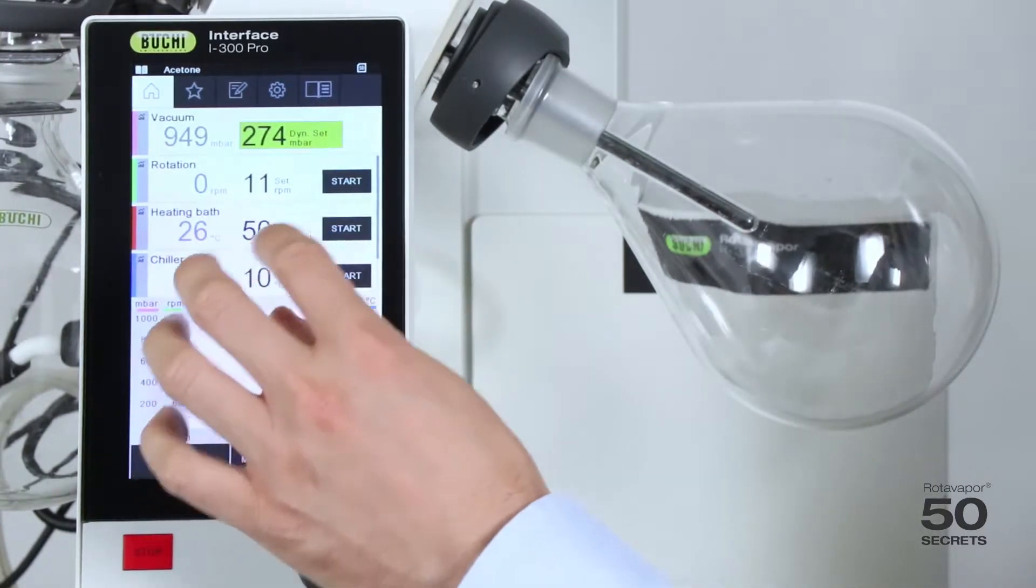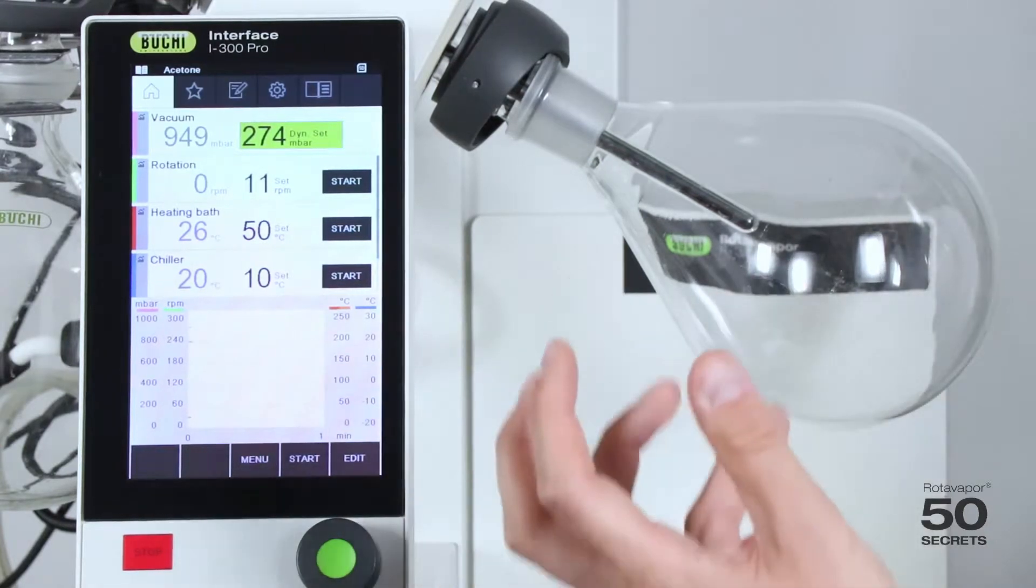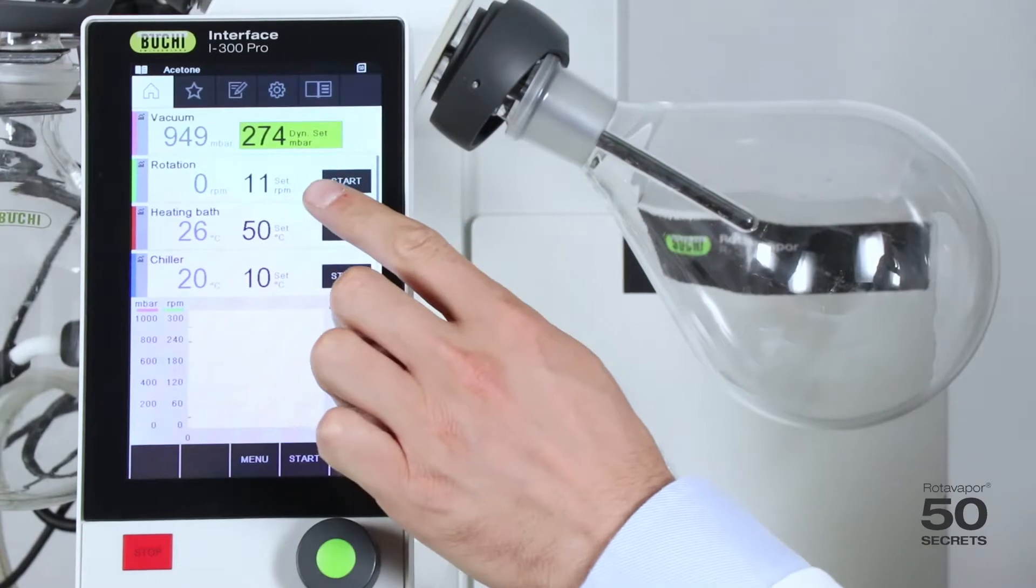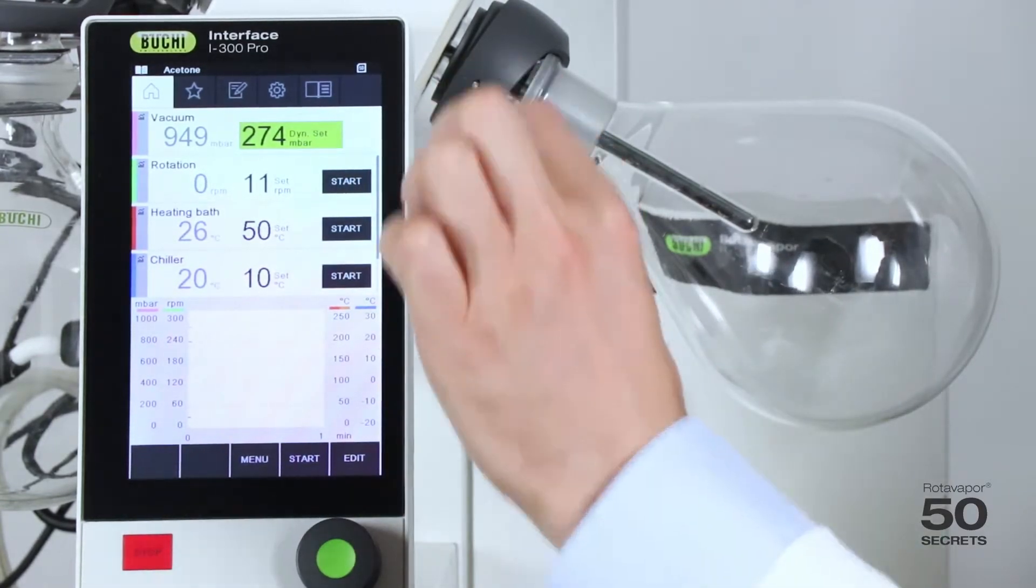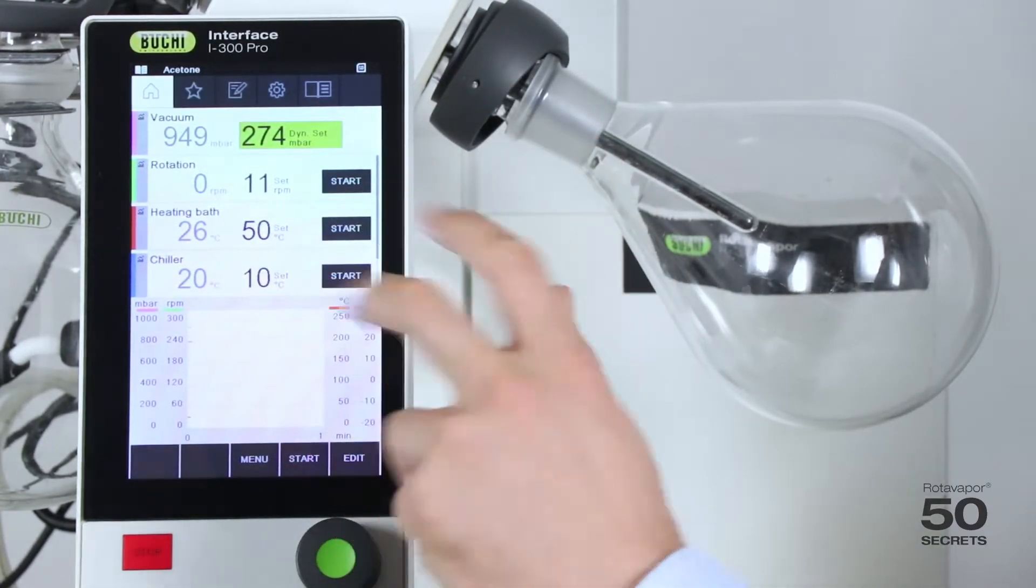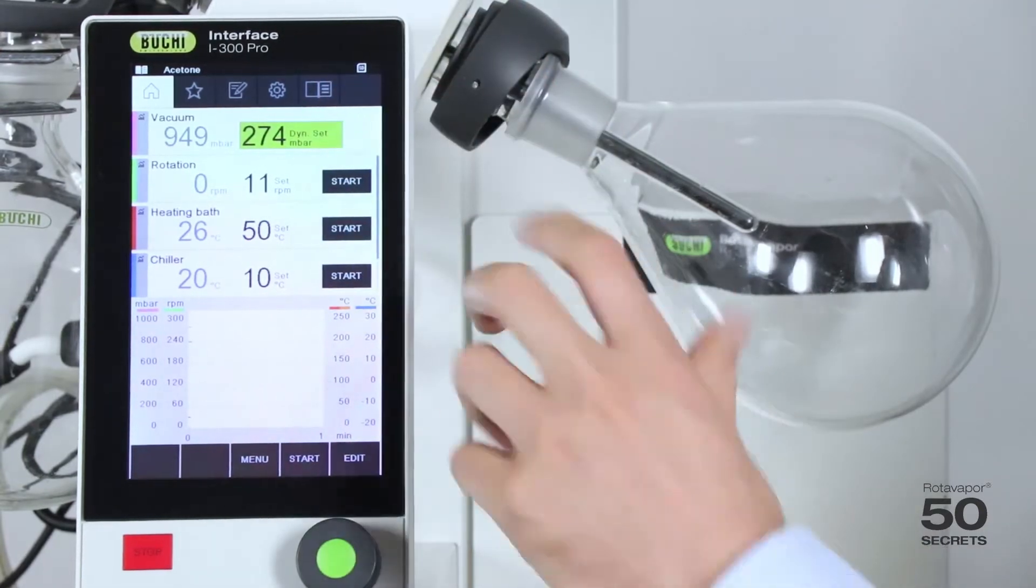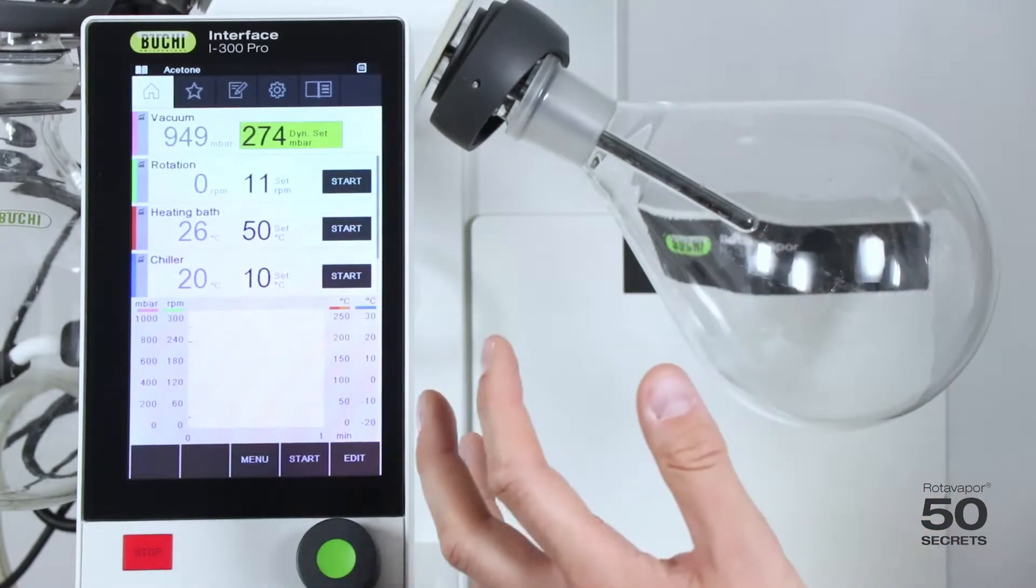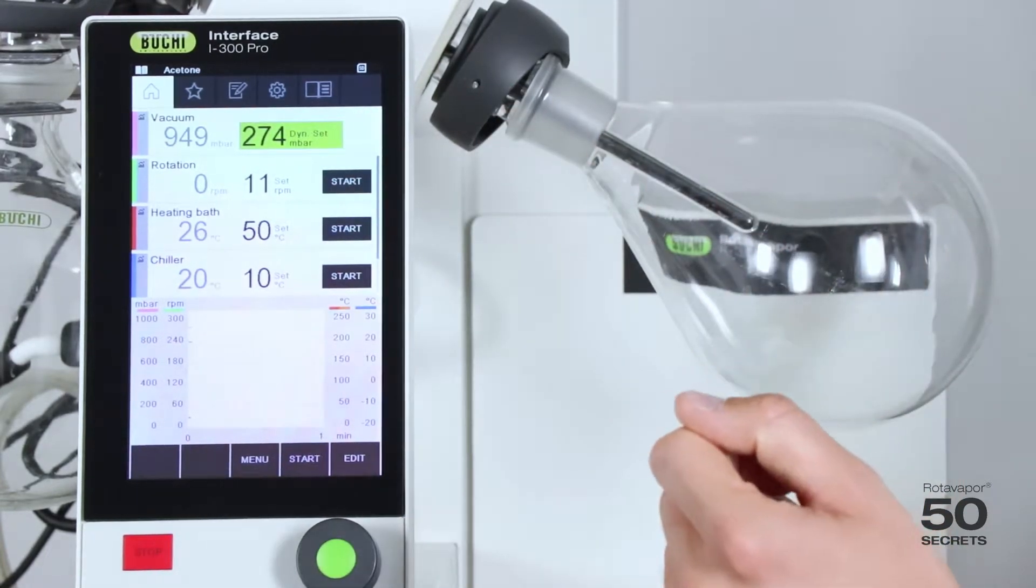So if I press start now what will happen is that the distillation will actually try to start, and it will adjust this vacuum to the middle one. So the delta T is the same below and above the boiling point. That means immediate start by using the solvent library.